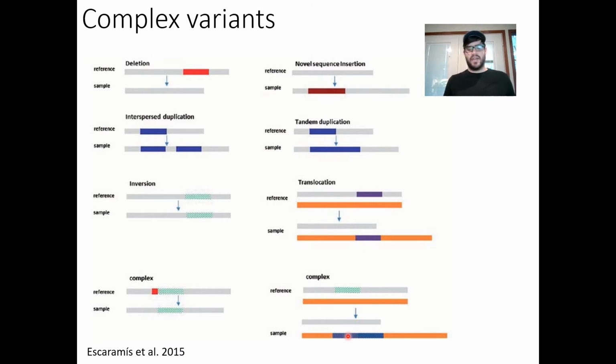We're just looking at, here's this base pair, it has a C, the other genome has a T. But in reality, there are tens of thousands of these more complicated differences that we don't necessarily capture with short-read data. And these can have really important biological implications.